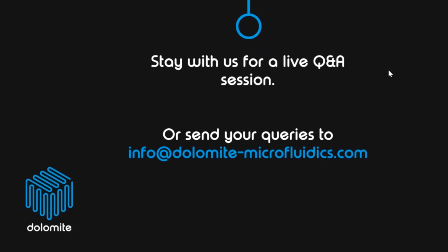You're limited by the volume that you have, and also the mixing process itself introduces a lot of variation in the batch process, as opposed to microfluidic methods, which are very, very reproducible. So there is a lot out there in literature as well, which you can have a look at, but the microfluidic technique by far produces much better lipid nanoparticles as opposed to stirring methods.